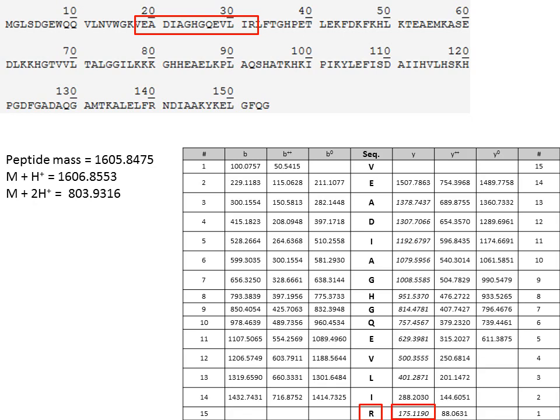If another molecule was fragmented through the second last peptide bond to release isoleucine and arginine still joined, we would observe another ion at 288.2. If another molecule was fragmented somewhere in the middle of the peptide, producing this fragment, we would observe an ion at 1008.5. We have now created a table of theoretical masses. Now we need to see how well it matches the raw data.